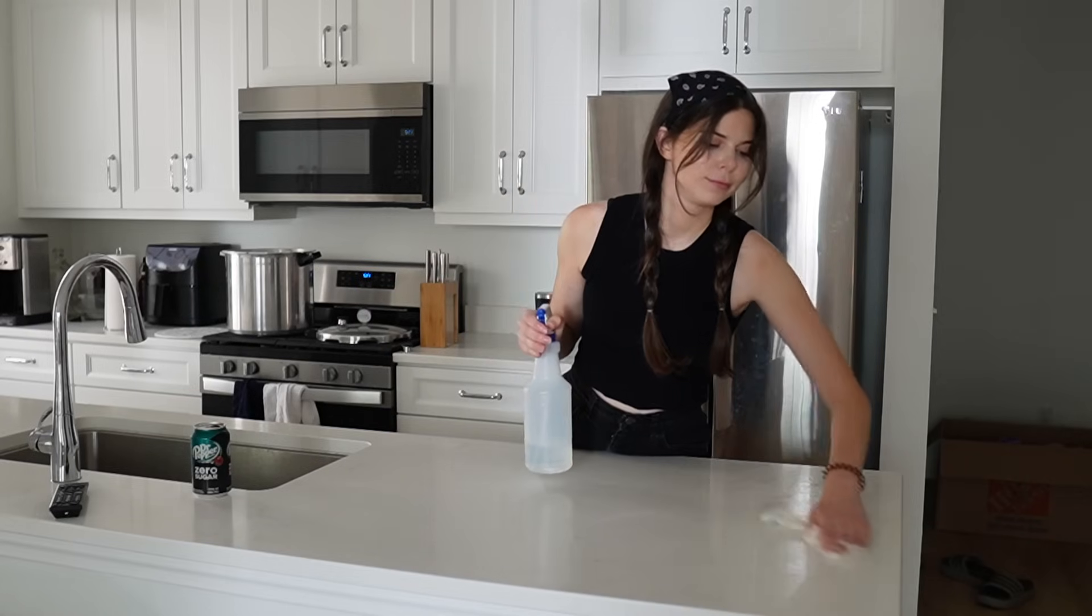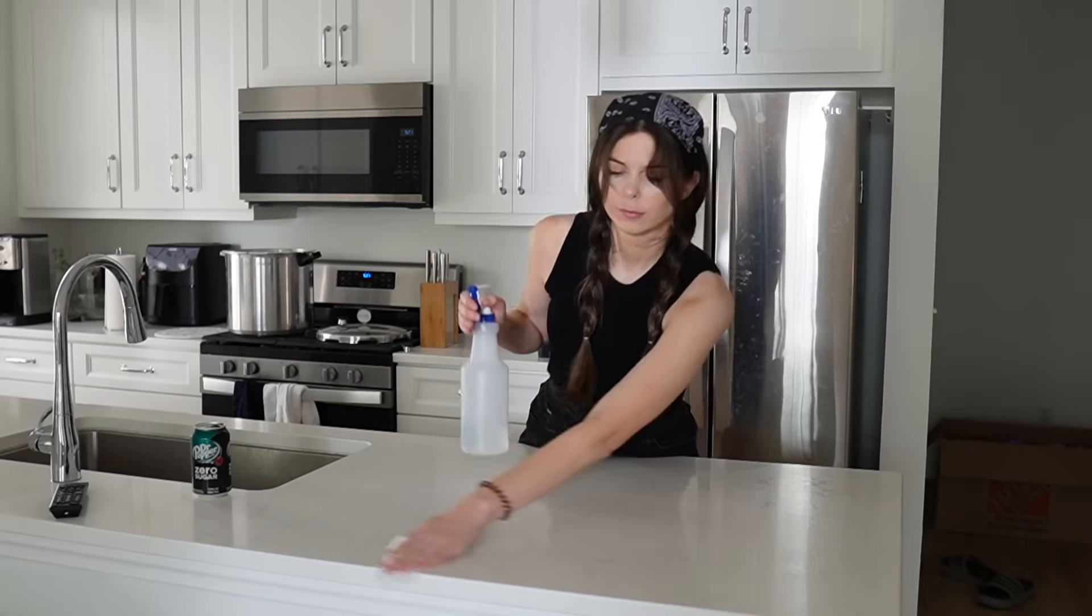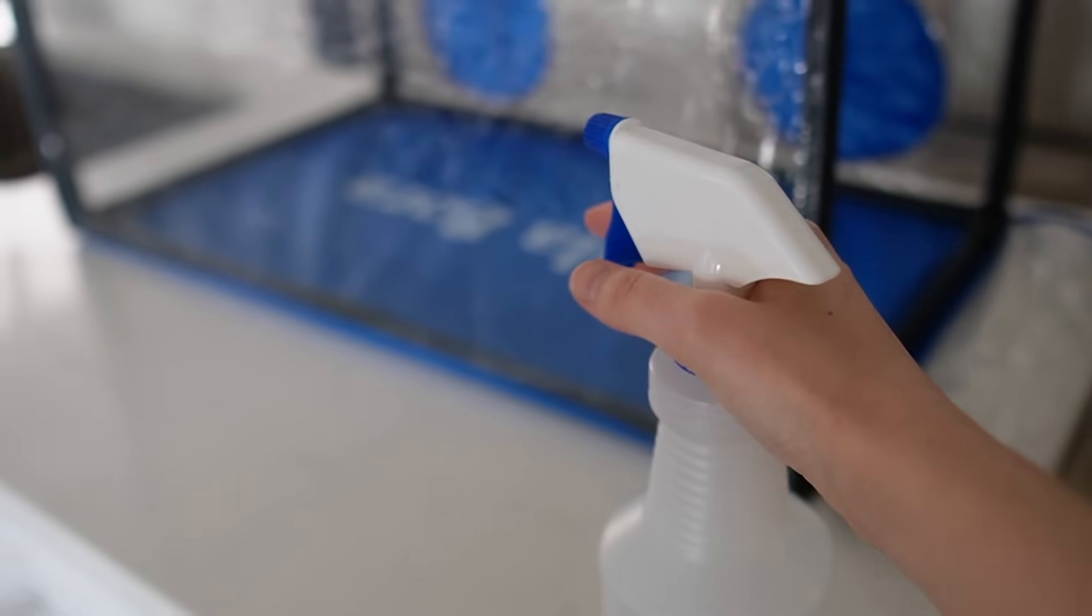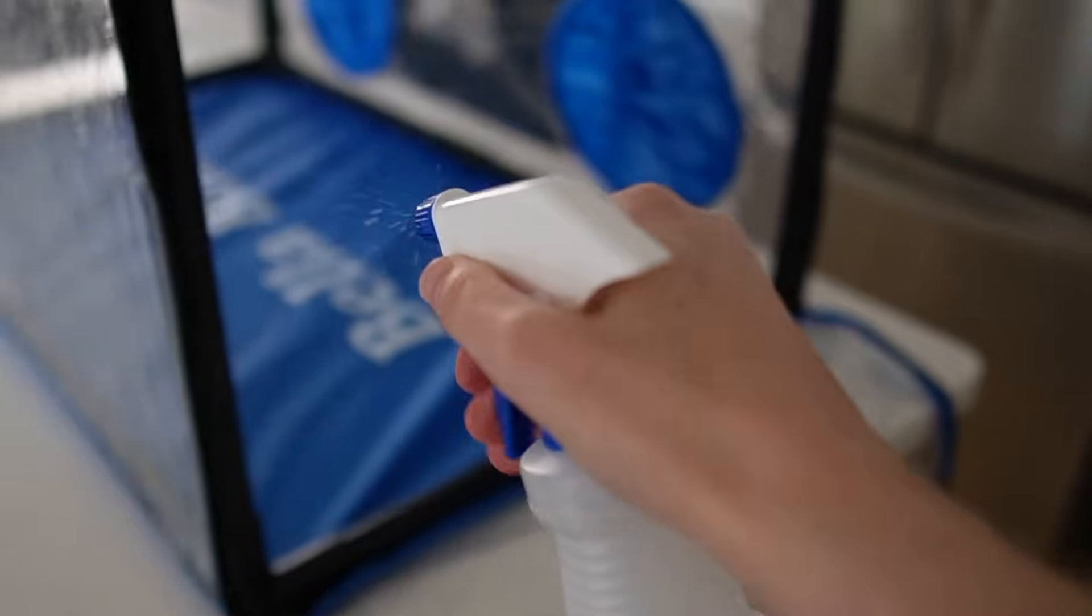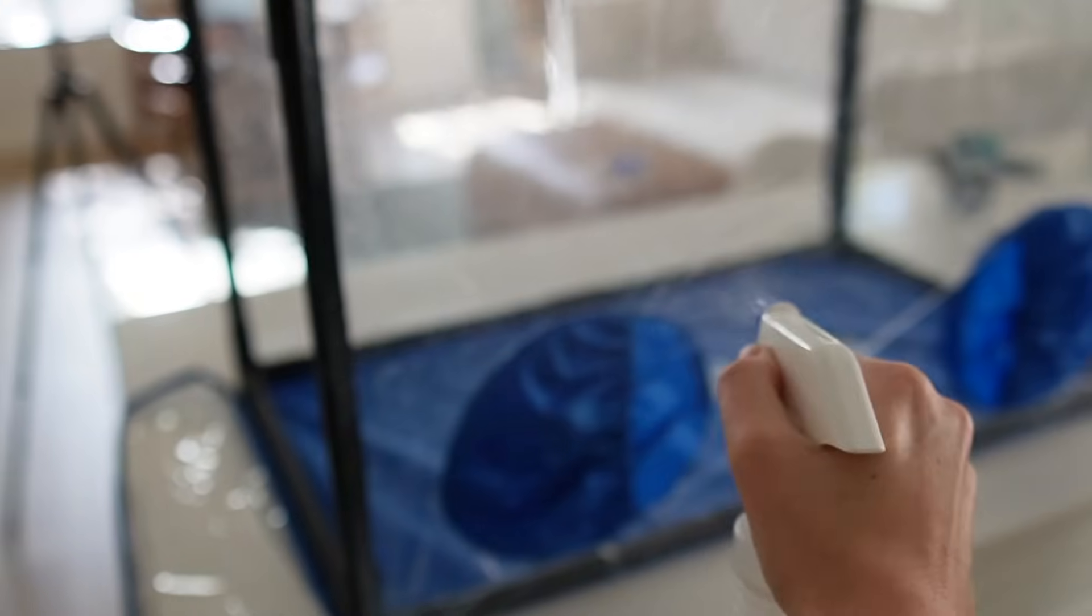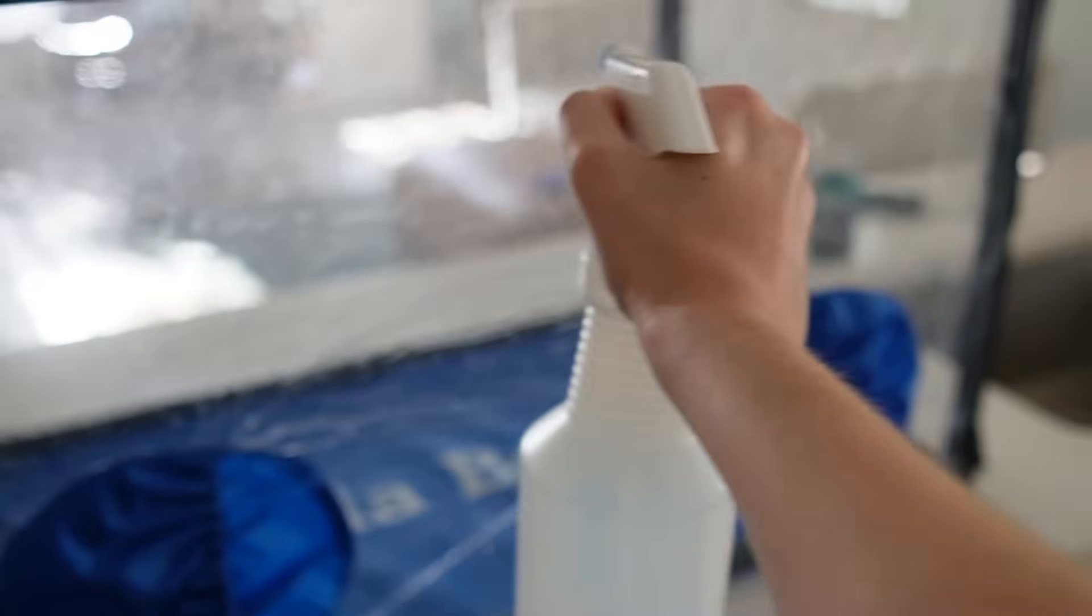Today, I'm using a still air box that has been completely sprayed down inside and out with 70% isopropyl alcohol. After cleaning the still air box, it's best to wait 15 to 20 minutes before using it so that the alcohol has enough time to disinfect the surfaces. If you listen very closely, you can hear the bacteria screaming for their lives.